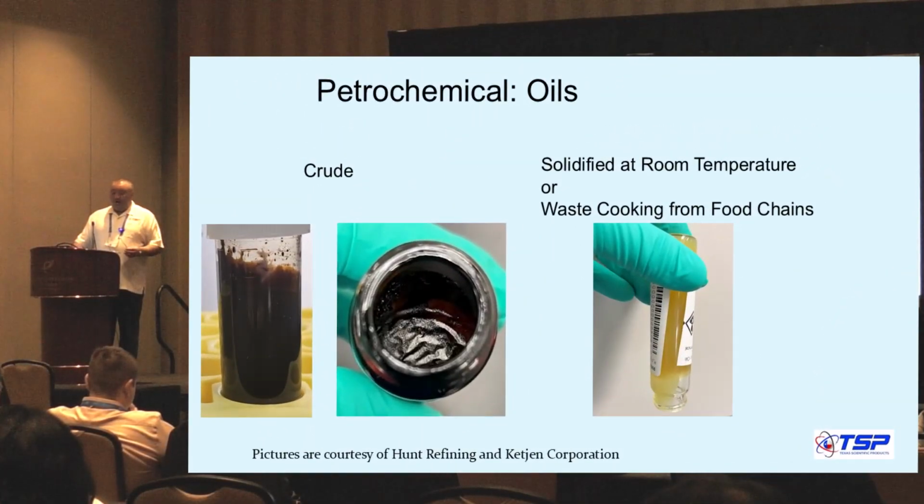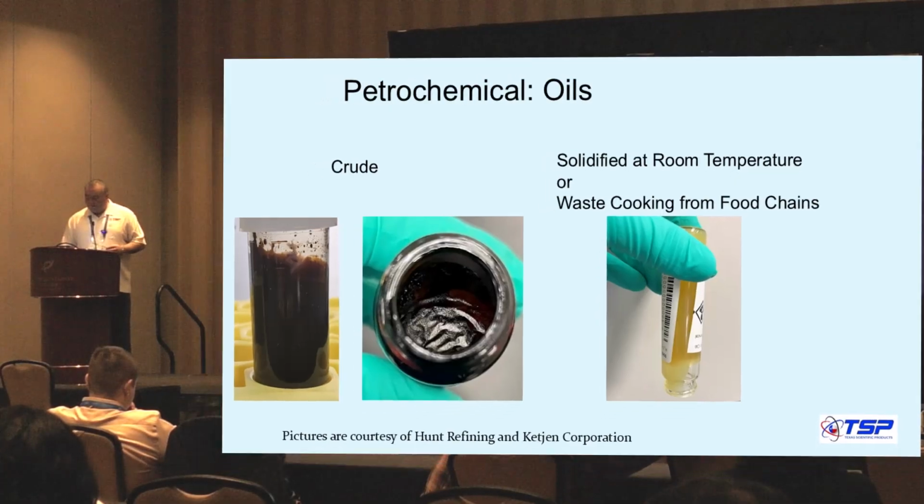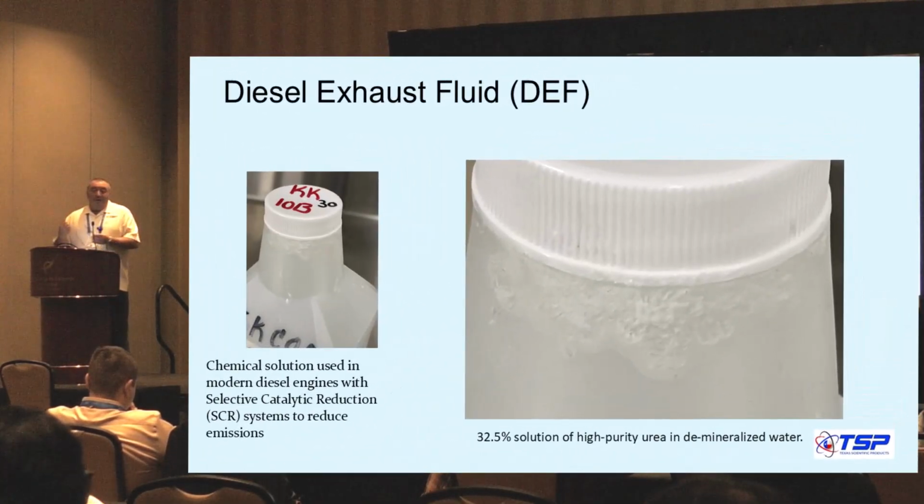Or the other thing, if you run any petrochemical samples. Anyone from the petrochem industry here? No? So that's how these samples look. And in this, even the ASTM method calls for a so-called Babington type nebulizer, which is a robust, non-pluggable nebulizer.